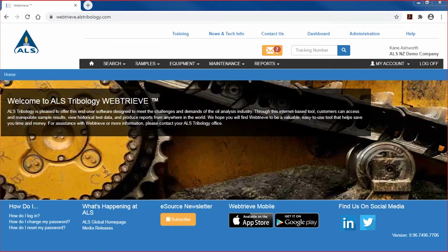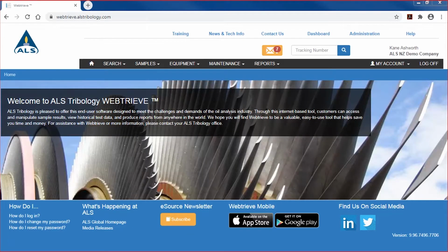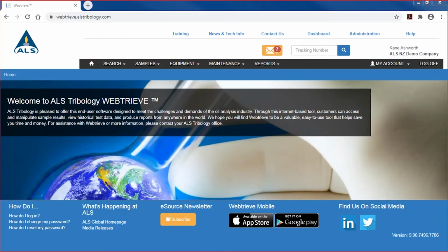This tutorial will review the process of sample submission using Webtrieve. Creating an online sample submission electronically saves time and avoids filling out all of the criteria by hand on the sample information form when you submit samples to the laboratory.